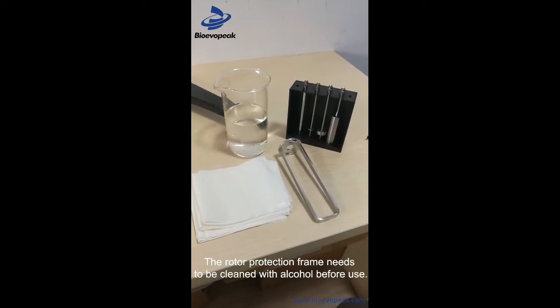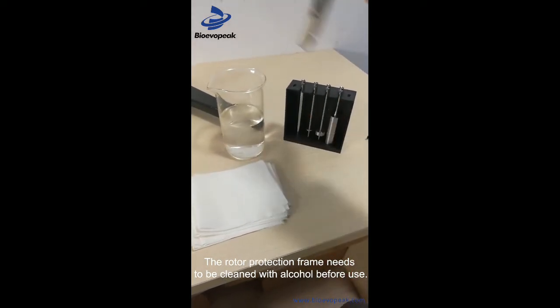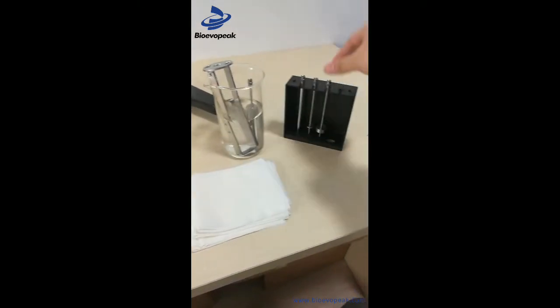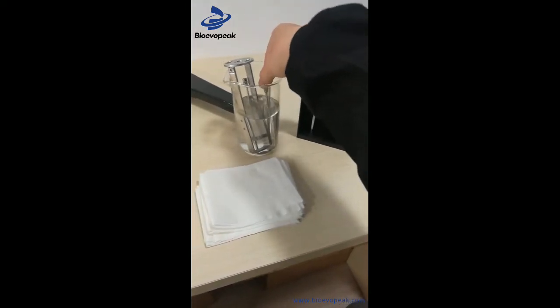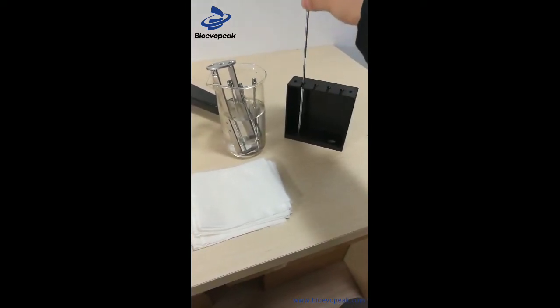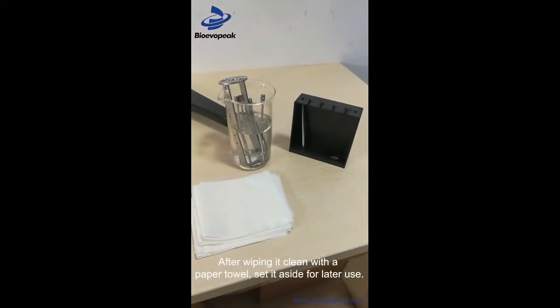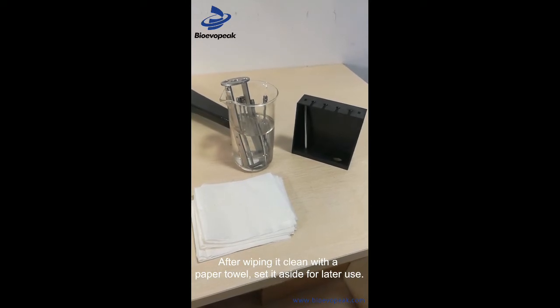Before using the rotor guard frame, it must first be cleaned with alcohol, then wiped dry with a tissue and set aside for use.